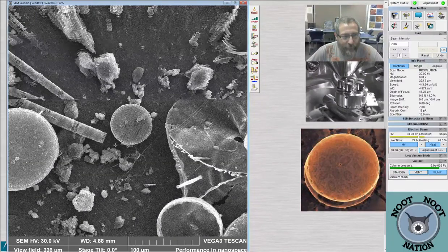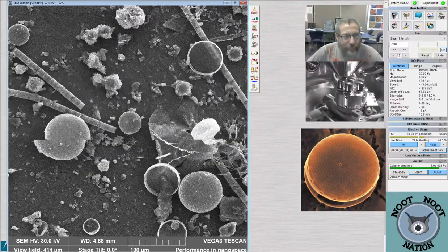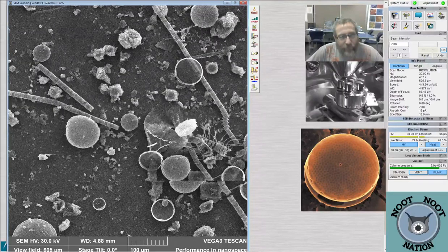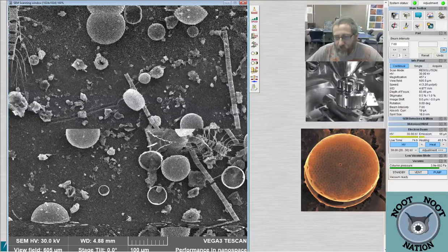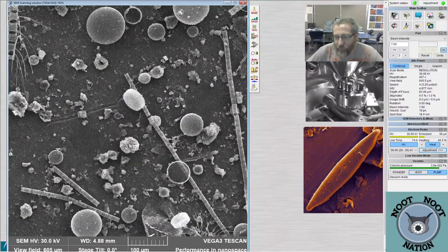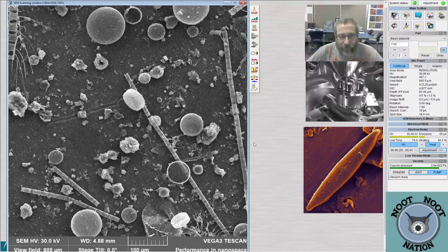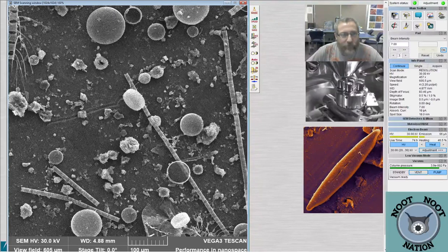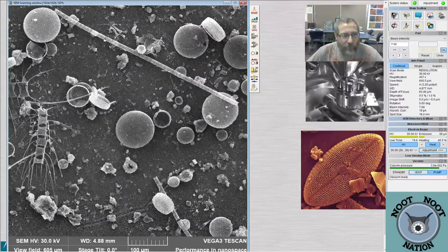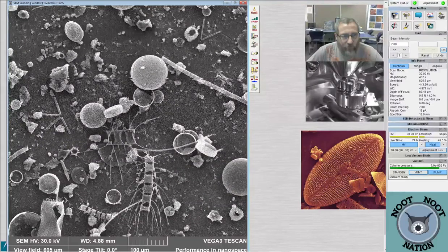Yes, they are small, bluesy. These guys are very small, positively skeletal. Oh wait, somebody was talking about skeletal. So those long ones are called Skeletonema. Yeah, these ones. Isn't that great? They're just so beautiful. There's such a great size range right now, too.